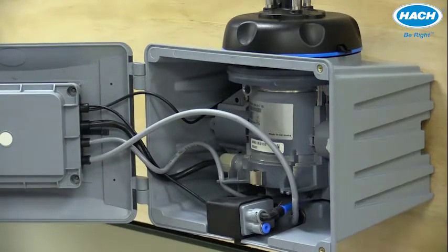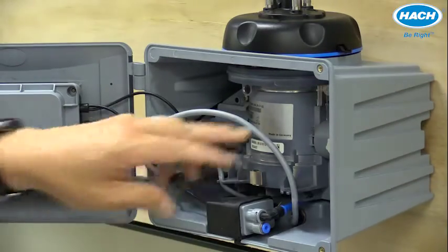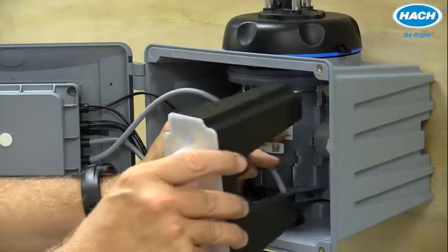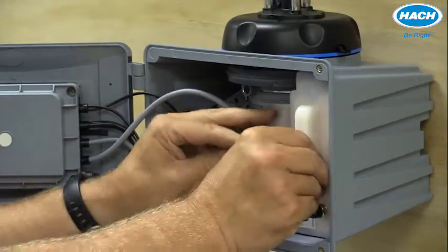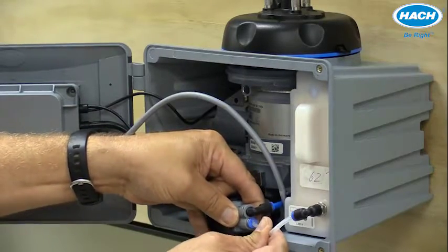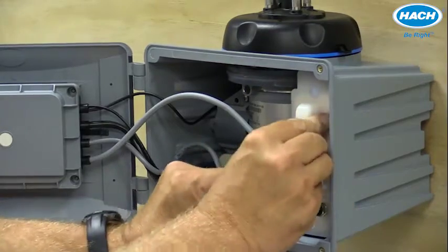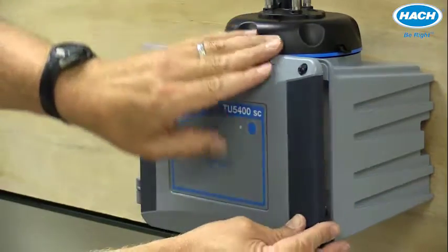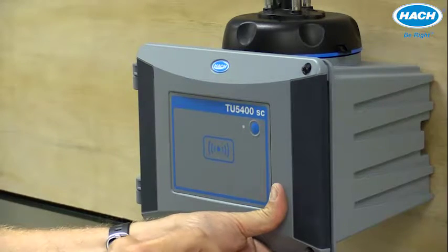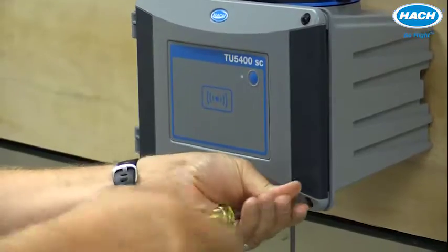Before closing the door, this is a great opportunity to install the desiccant cartridge to keep humidity from causing any problems with the sensor. It simply slides into place and the tube can be connected to the quick connect on the side of the pump. Then we can close the door and tighten the two screws in place.